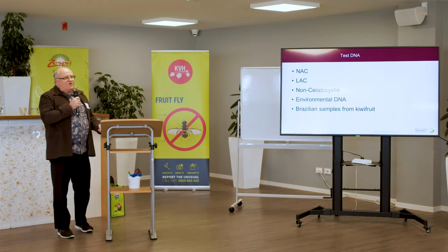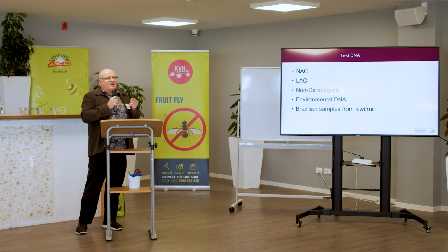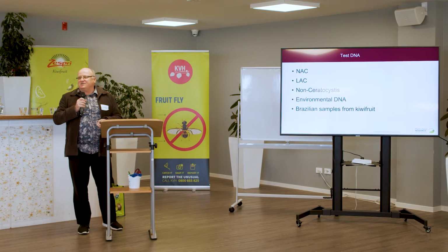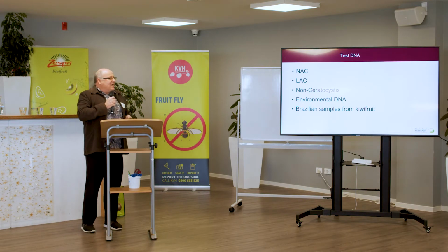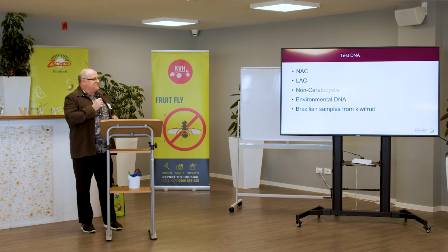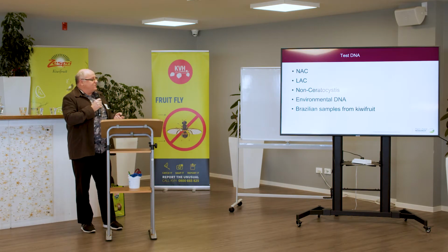While false negatives mean that we would miss stuff, false positives actually give a wrong picture, that we might be thinking we have something which we actually don't have. And that can have ramifications. When you want a response to an incursion, you want good quality information. You want to know it quickly, but it also has to be good quality information. We want to know, yes, it's this, and we're not picking up something that is just in the environment that's going to interfere with our assays. We've also got quite a number of Brazilian samples which were really useful for testing the assays that we did, and we're very grateful for those.